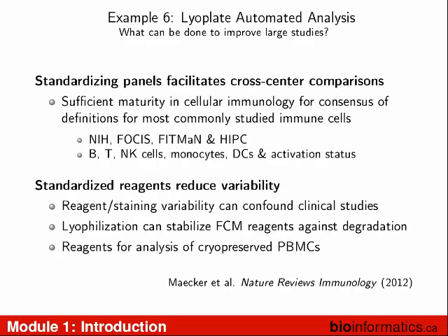Example six. Two more examples, six, seven, eight. A few more examples to go. Three minutes, I can do this. Standardizing data across large centers is very important. The more you can do to standardize your data, the better and happier we're going to be.